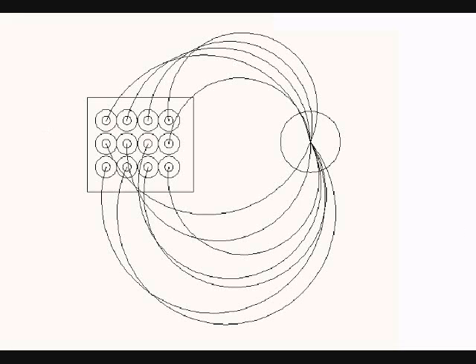Hello, this is Abhi Gopal again, and I'm here to talk to you a little more in detail about the algae bioreactor. Now here's a basic blueprint of what this is going to look like. So these are the water bottles that you've heard of, and these are actually going to be the plastic tubes that we're going to pick up from Home Depot.